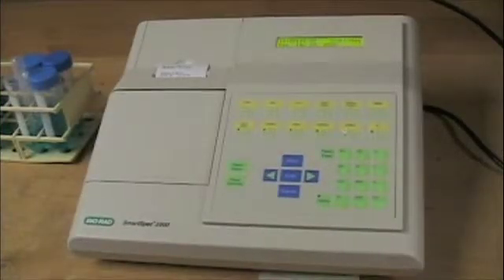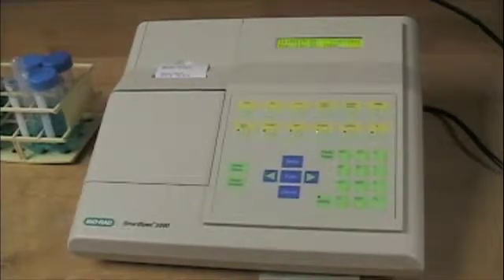This is the Smart Spec 3000 and we are going to use it to read absorbances of several samples of Fast Green.